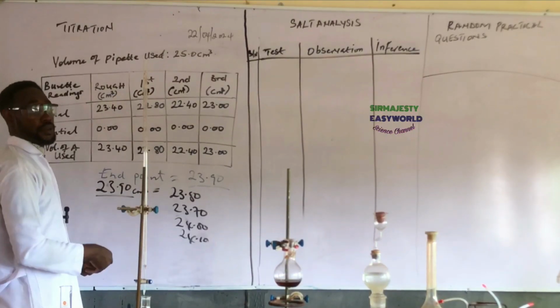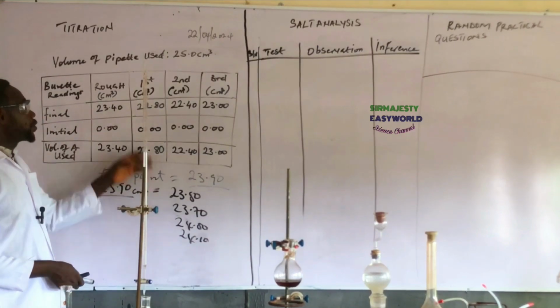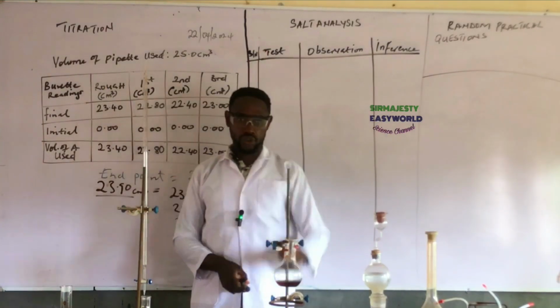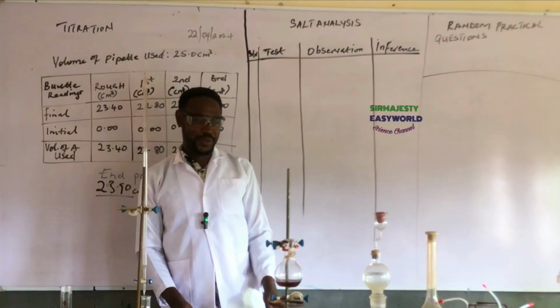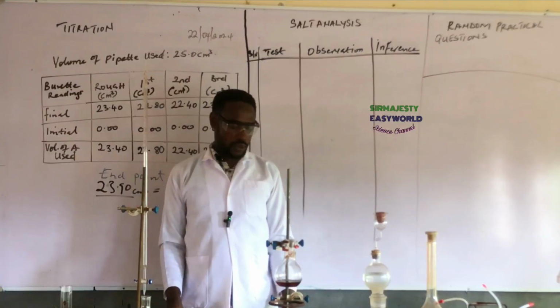If you like, you can bear in mind your teacher's endpoint. I'll teach you exactly how you manipulate this table. Immediately you hear your teacher's endpoint, your table is short. I don't do it because I'm training real scientists, you know what I mean? But they will do the practical and do it accurately. So that's why I don't have fear.